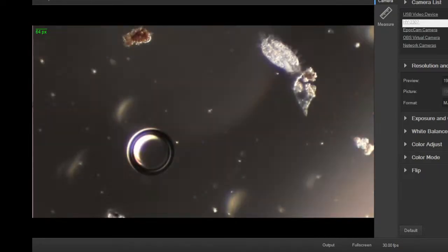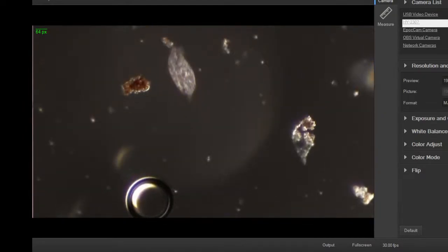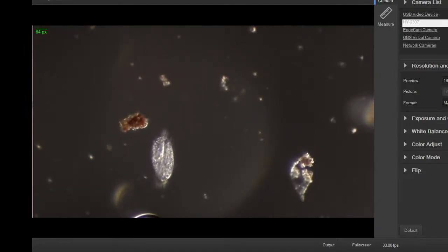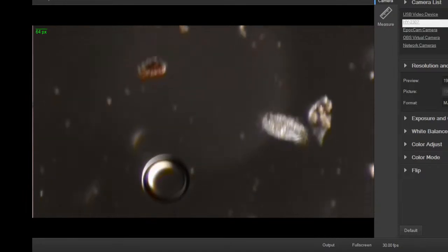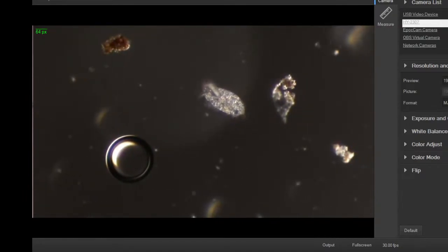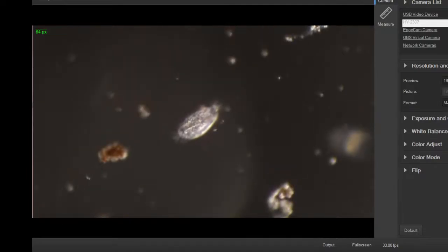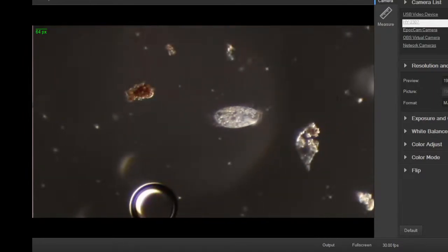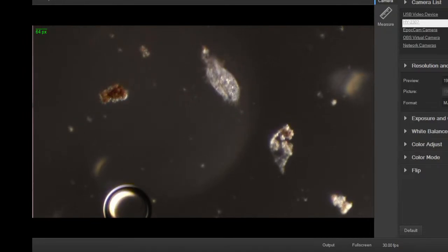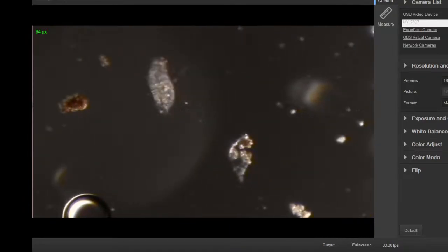Get this adjustment again here. A little more dark field action. But this one has a nice kind of oral groove. It's like a gullet, where it's a single cell, but it has structure. It's like a primitive version of a throat or a mouth. And it doesn't swallow. It actually forms vesicles at the gullet interface with the water. Those vesicles brought into the cell form into a food vacuole, and digestive enzymes go into the food vacuole. So it basically creates a microstomach for its meals that lasts as long as the meals. And then it breaks it apart and recycles it for more vacuoles to be created.